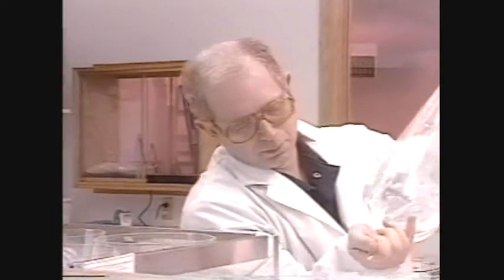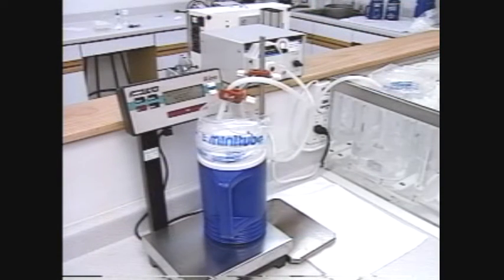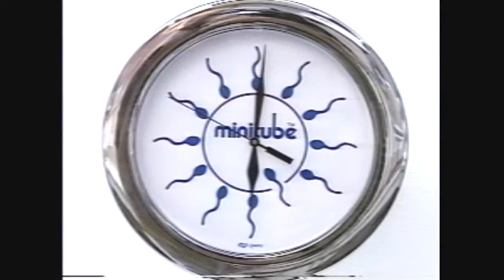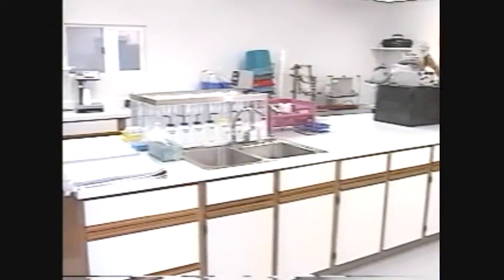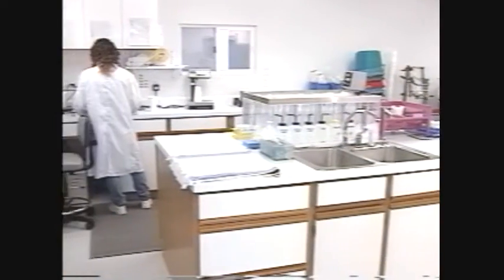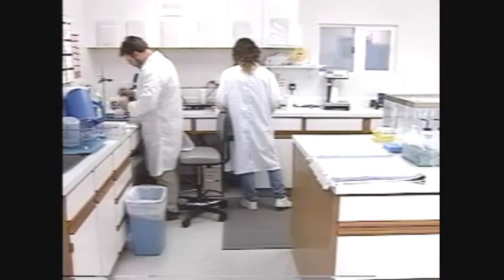The importance of extending and cooling semen as quickly as possible after collection cannot be overstated. Ejaculate should be extended and cooling begun as soon as possible after collection, and certainly after not more than 20 to 30 minutes. Holding semen longer than this, whether extended or not, can result in a reduction in semen quality and fertility. This effect may not be apparent as a reduction in motility.